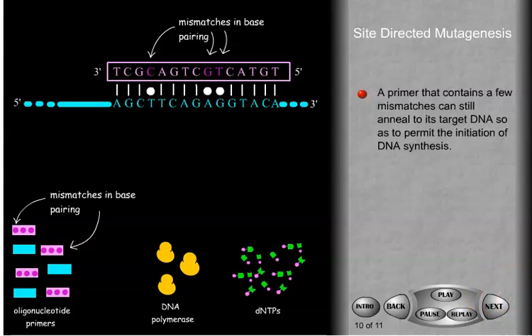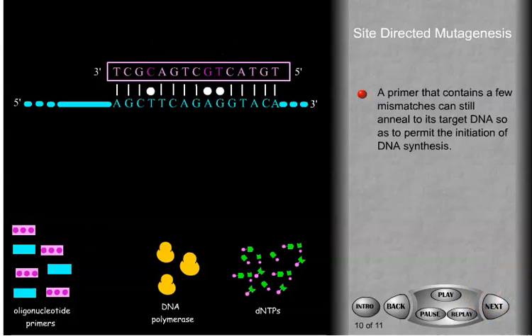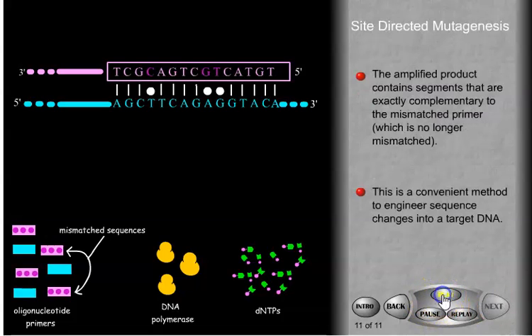Oligonucleotides put into the reaction don't have to match the template exactly. They can still anneal with a small number of point mutations where the base pairs are not complementary to the template. The oligonucleotides with the mutation are incorporated into the newly synthesized DNA.